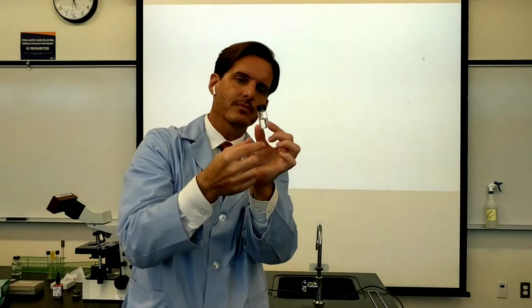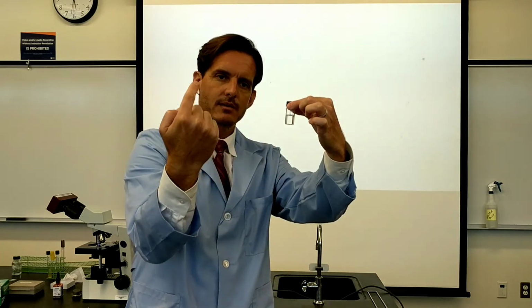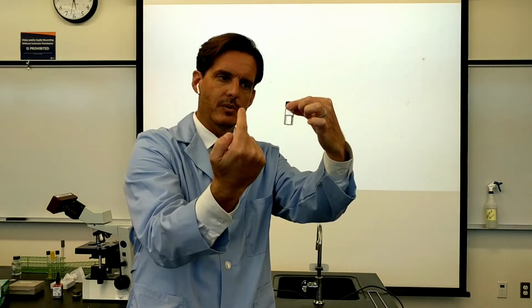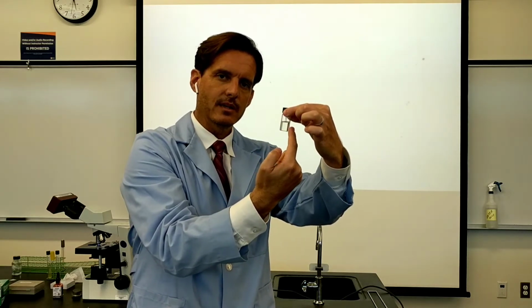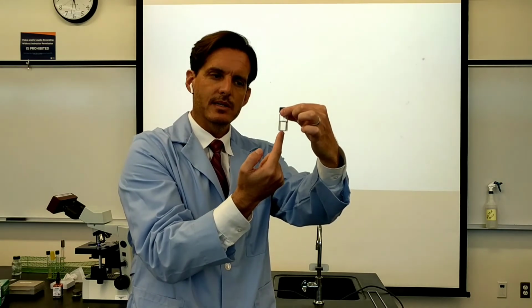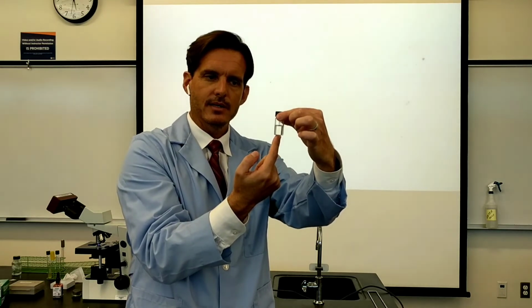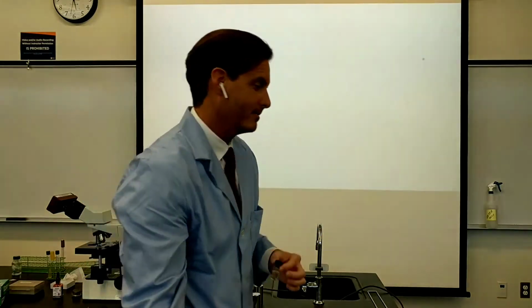But down in the bottom of the vial, you've got the light going 1.0, 1.0, hitting the glass, 1.5, hitting the oil, hitting the glass, hitting the oil, all 1.5, and that's why we don't see the glass rod inside the oil portion down below. Anyway, it's kind of like a little magic trick.